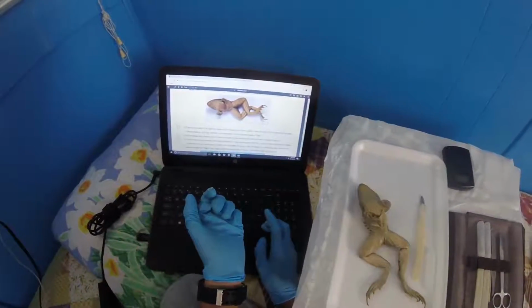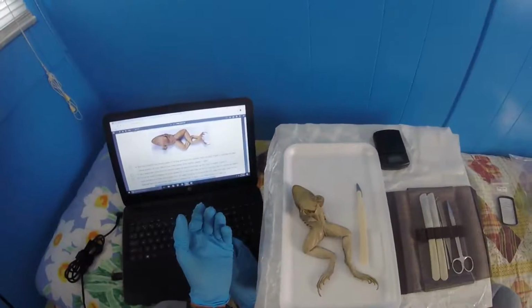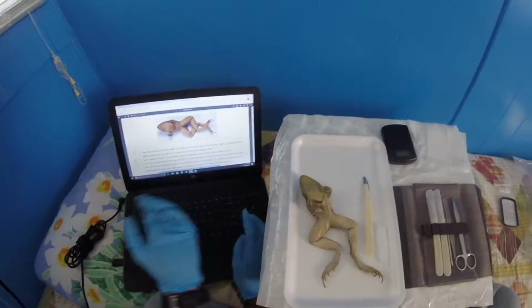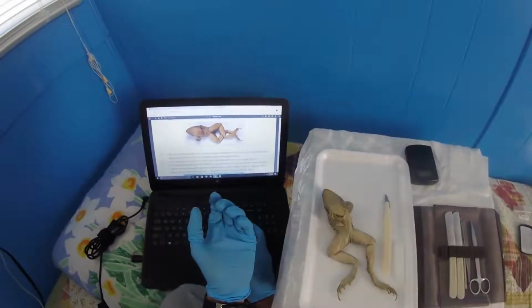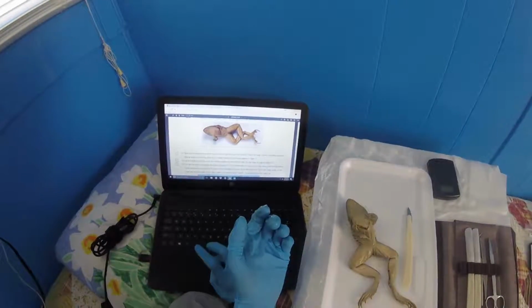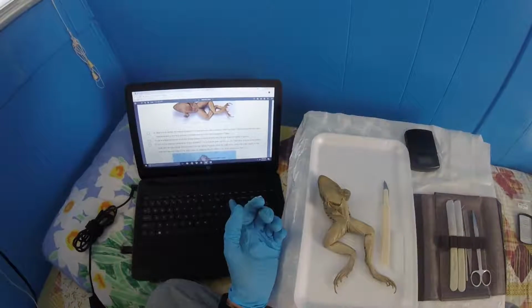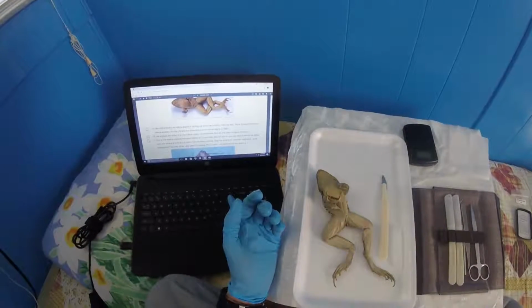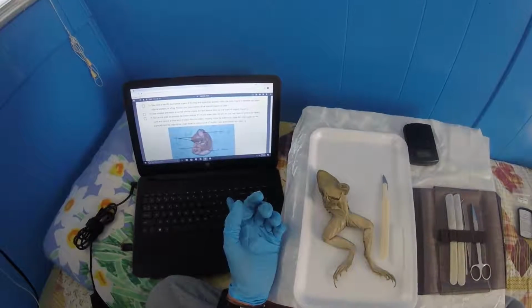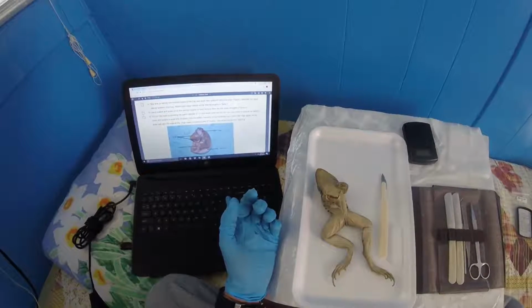Take time to identify internal organs of the frog and study the positions within the body. Figure 3 identifies the basic internal anatomy of the frog. Record your observations in the internal organs. Use the scalpel and probe to cut the internal organs out and remove them as one mass. Turn the scale on by pressing the button.